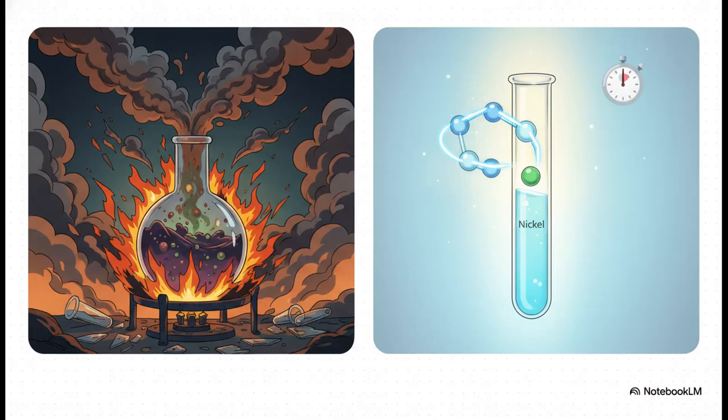And this slide right here brilliantly illustrates our methodological evolution. We are finally ditching the slow, dangerous acid digestions of the past. Historically, chemists had to use open-vessel wet digestion or dry ashing. They were literally burning the oil in a furnace or boiling it in concentrated, highly corrosive acids just to break down the lipids and free the metal. Honestly, it was a total nightmare. Those old methods are agonizingly slow, sometimes taking an entire day. Plus, they're acutely hazardous to the operator, incredibly expensive, and super prone to analyte loss or external contamination.